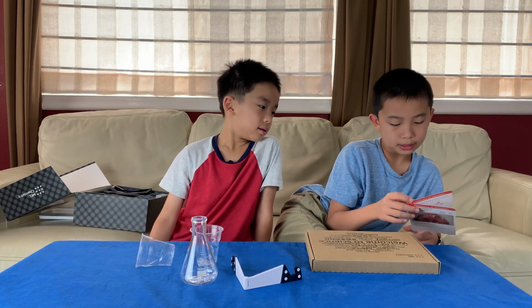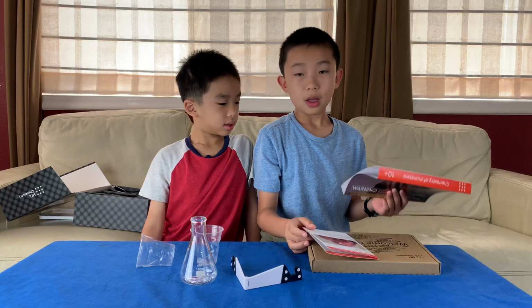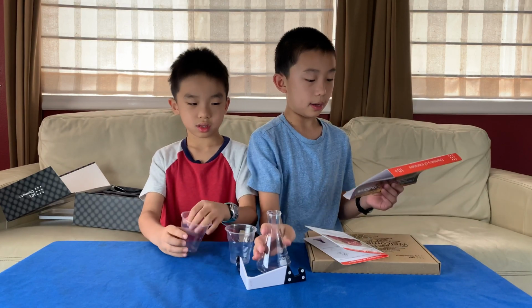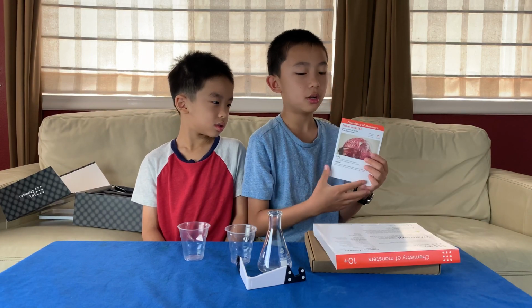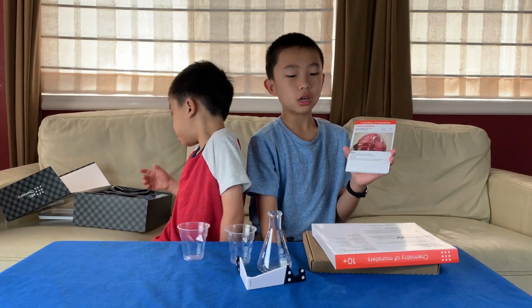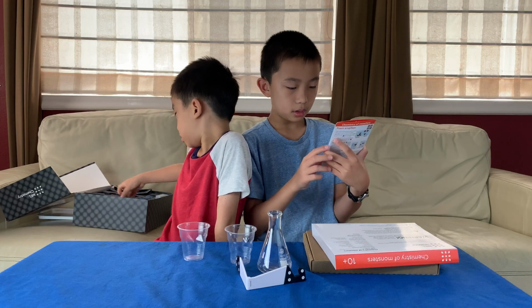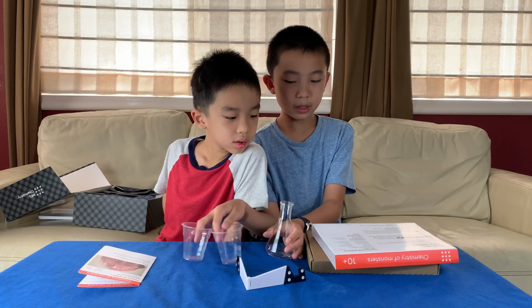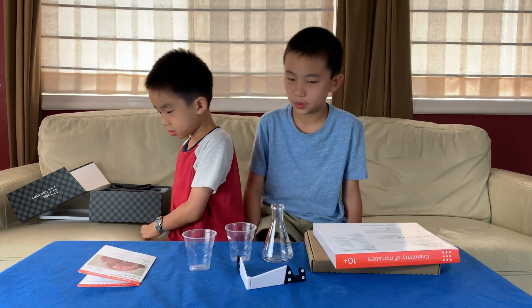What do we need? They don't exactly tell you here, so let's just get everything from the back. Okay. Right now we're collecting all the equipment we'll need for the experiments from the starter kit. And I'm not completely sure what we'll need for the foam eruption, just the foam eruption, because this is what we'll be doing first. The reason why is because the danger is lower, so it's kind of like a warm-up, and also it'll take quicker. So we're still fine. Right now we got the conical flask and the 2 disposable cups that we'll need. Plastic tray, and then we need a flame diffuser.